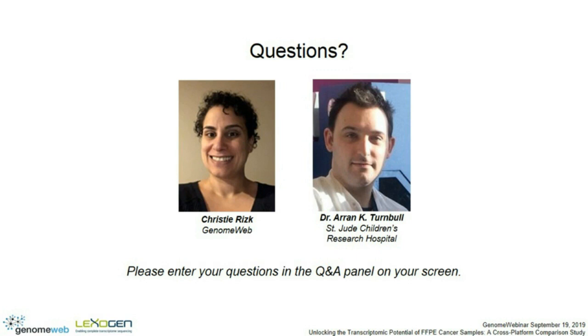Okay, great. And what are the ranges of necessary RNA input for your preferred RNA-Seq platforms? So again, this varies from platform to platform, and probably the genomics core is the best people to speak to with this.